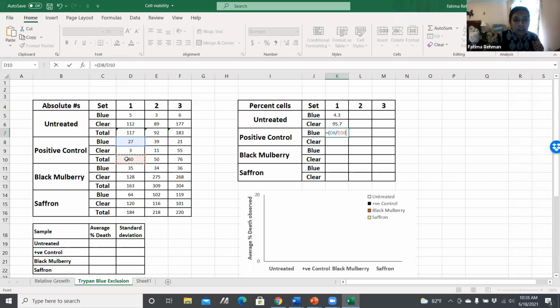So yeah, that's what I'm going to do for this particular one as well. And actually you saw earlier that I had it set up that way. That's why this graph is still here. This is still here. When we get those numbers, it's going to start populating it automatically at that point. I know I talk a lot, so if I'm talking too much or talking too fast, let me know. I will slow down and go over the material again if you're lost.